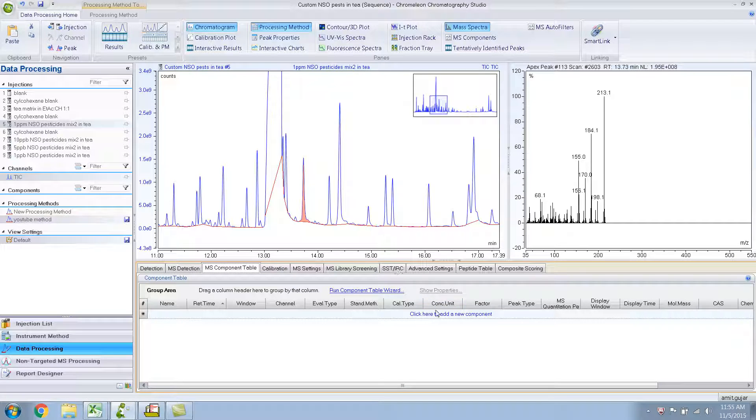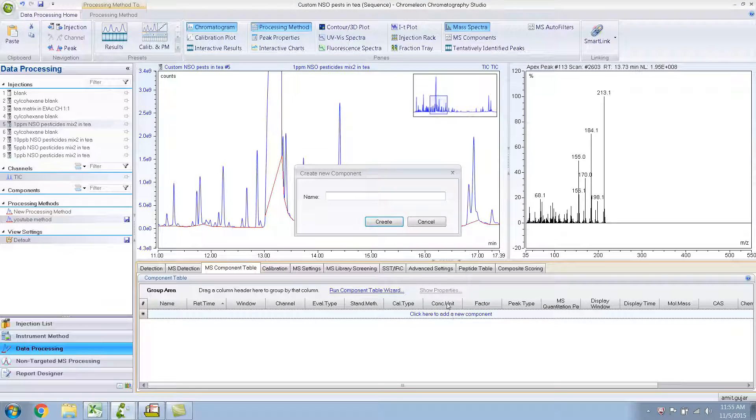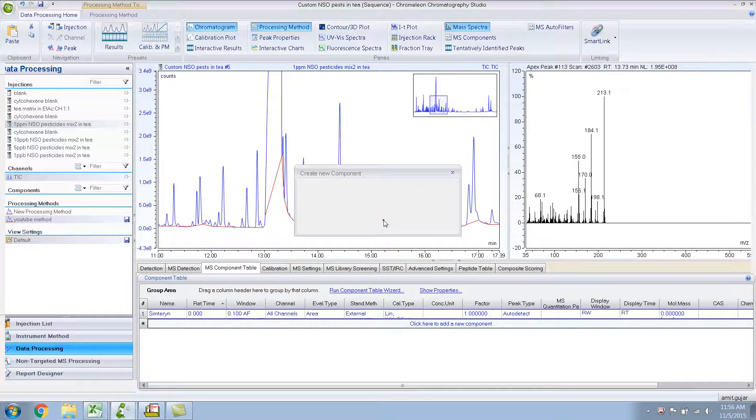So that's what I'll do, I'll add that component here. There are multiple ways to do this. I'll show you one way, which is manually adding it. You click over here, click here to add a new component. And the component is Simteryn. I hope that's the correct spelling. And I click on create.